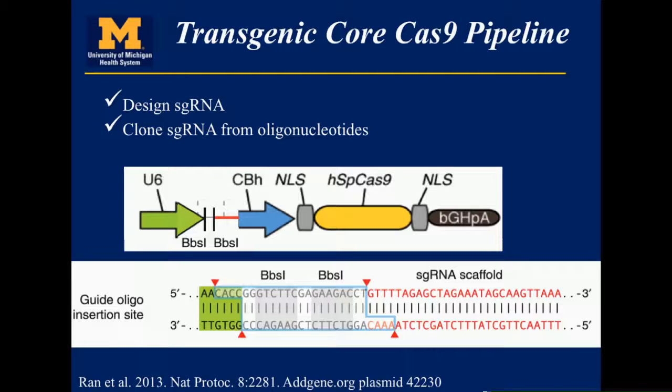We had a lab on campus who actually had a high school student doing this work, but high school students tend to go back to high school in the fall. She went back to high school, and then we had some eminent postdoctoral research fellows that picked up the project, and after we got their reagents, like we would do the microinjections, no mice would be born, and so then we realized we have a problem, and so message to the postdocs in the audience, just follow the protocol, don't try to improve it. Okay. So once we went back to the original protocol, then we got good results, and we got viable embryos.